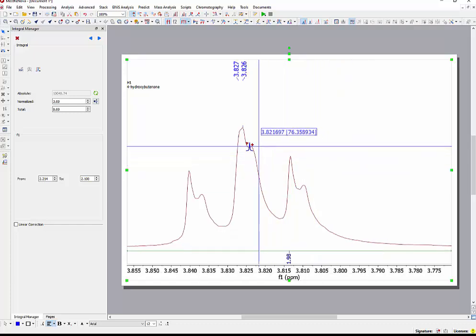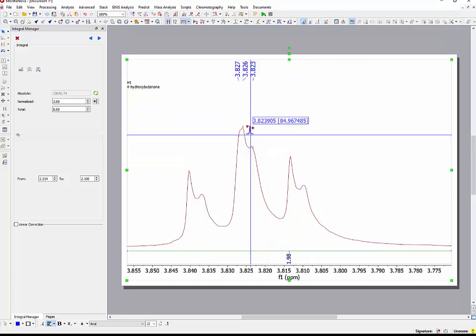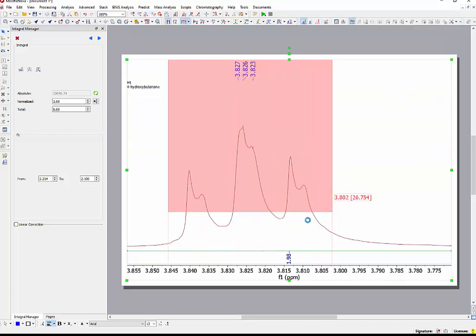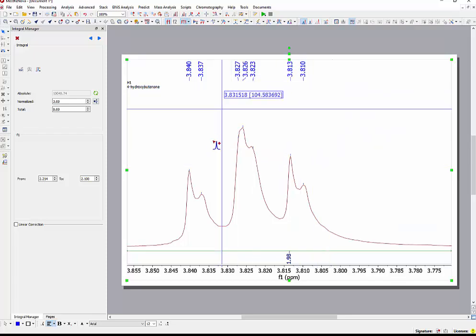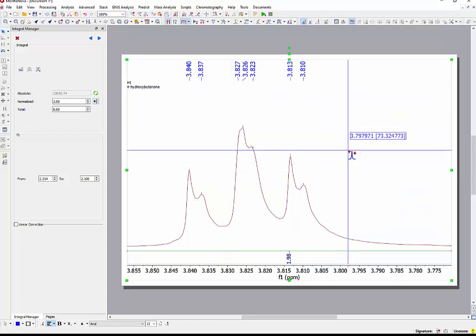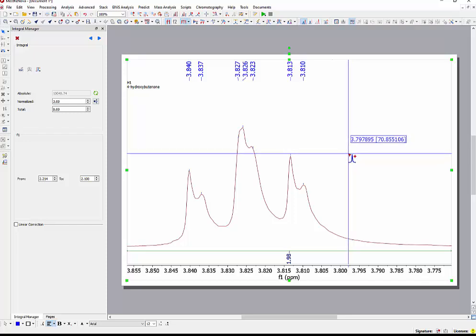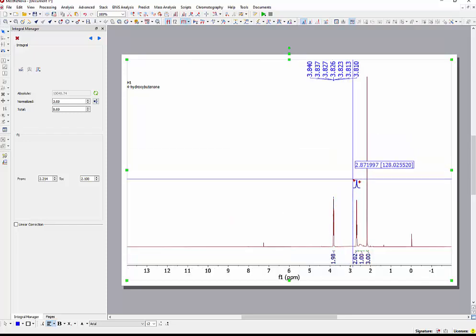If I now were to highlight these 2, then I should have at least this little peak count as well. And if I highlight all of them, then again, I have a whole bunch of peaks that count. This is what I'm trying to communicate: you get to choose what the threshold level is for the peaks. H returns me all the way back out.